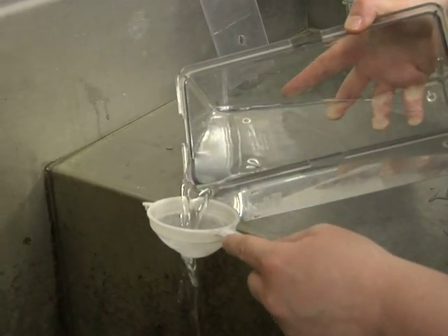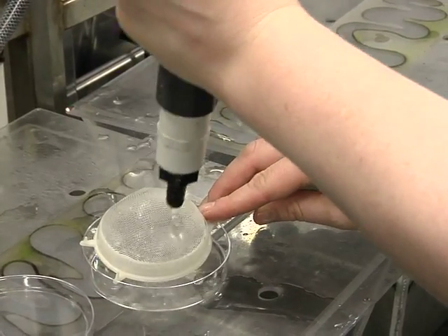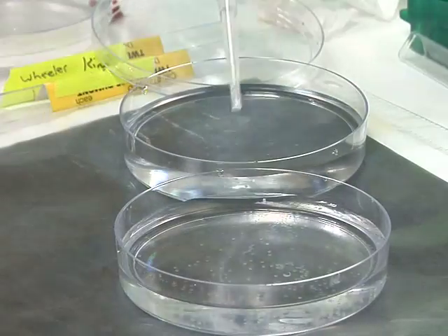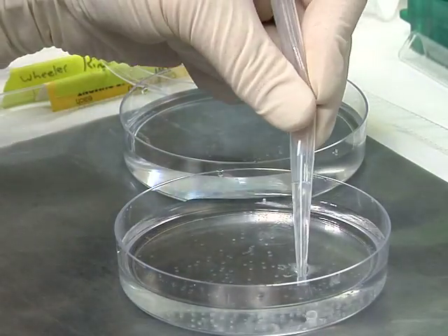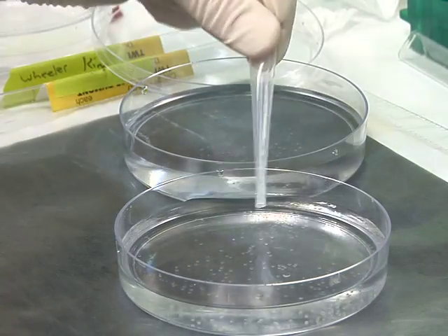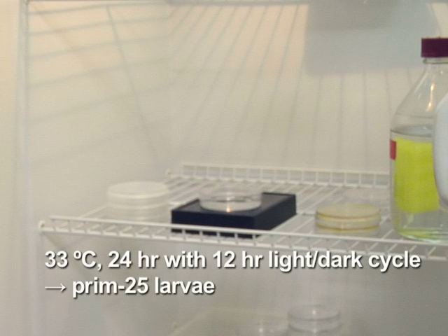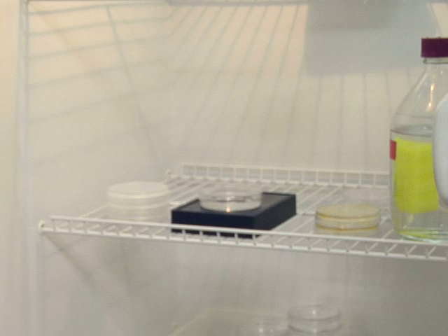Use a sieve to collect zebrafish embryos from a spawning tank on the day before the injection, and store them in an egg water solution containing 60 micrograms per milliliter of instant ocean salts in sterile deionized water. Then place the embryos at 33 degrees Celsius for 24 hours with a 12 hour light-dark cycle. This permits development of the embryo to the prim 25 larval stage, the optimal stage for infection.